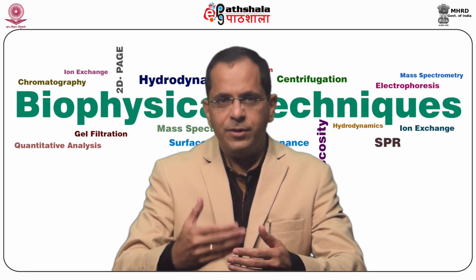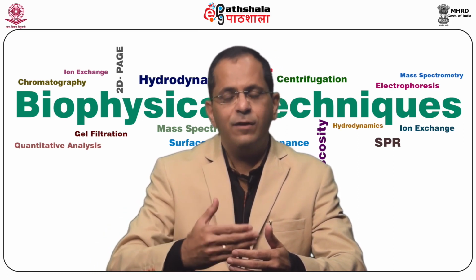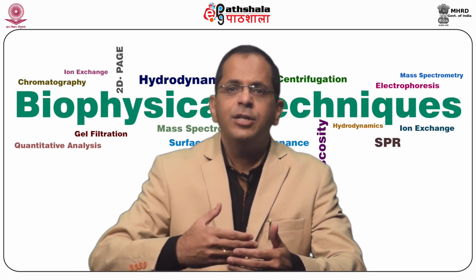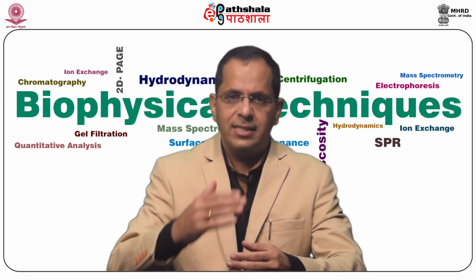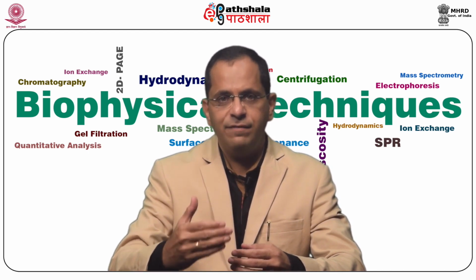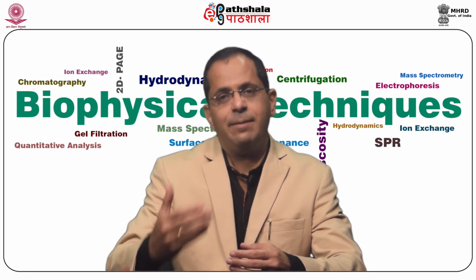Sodium dodecyl sulfate solubilizes the protein by binding uniformly along its length, to a level of 1.4 gram of SDS binding to a gram of protein, giving it a very uniform electric pull. All the proteins in the sample are therefore linearized and uniformly coated with a negative charge on their surface, and as a result, the charge to mass ratio of all the proteins is the same.